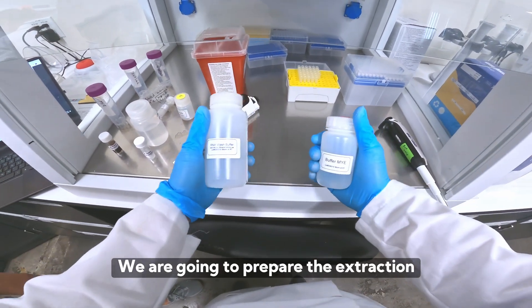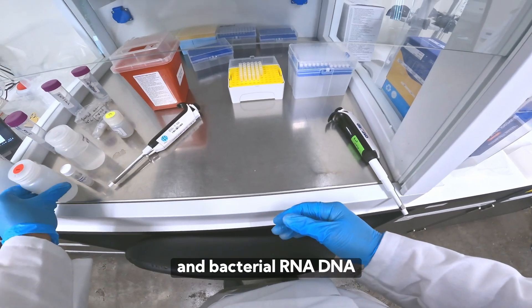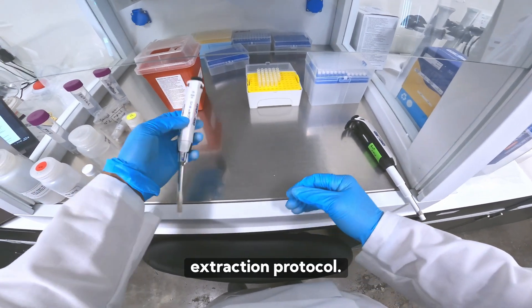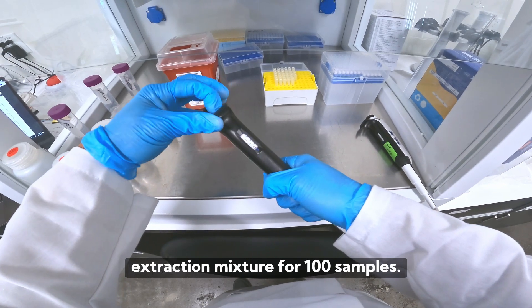We are going to prepare the extraction plates for the Filtris automated viral and bacterial RNA DNA extraction protocol. We will create an extraction mixture for 100 samples.